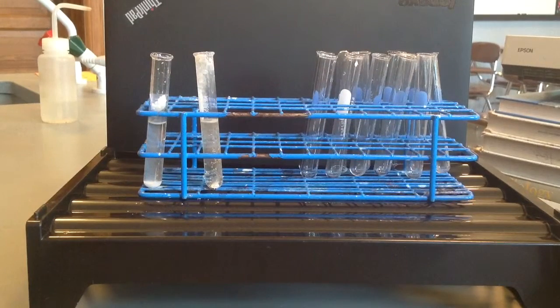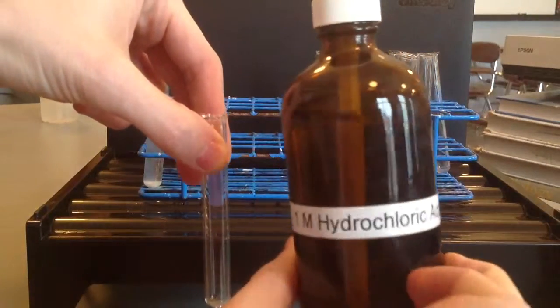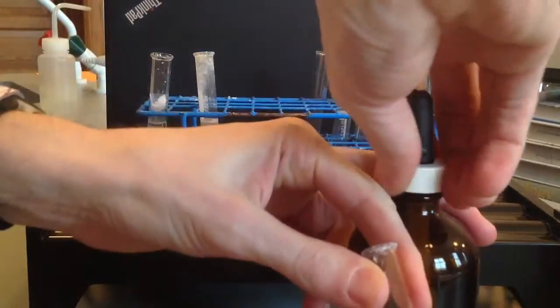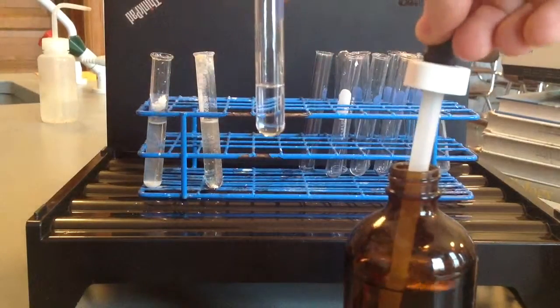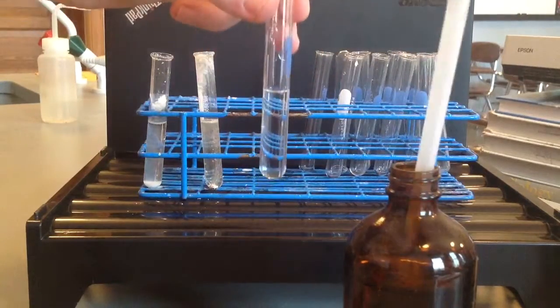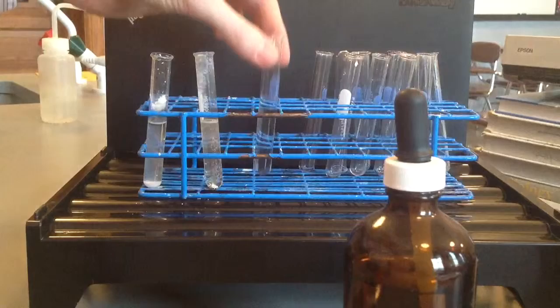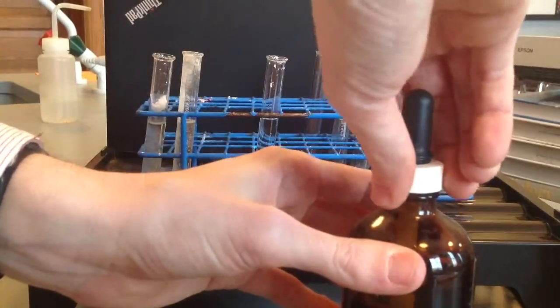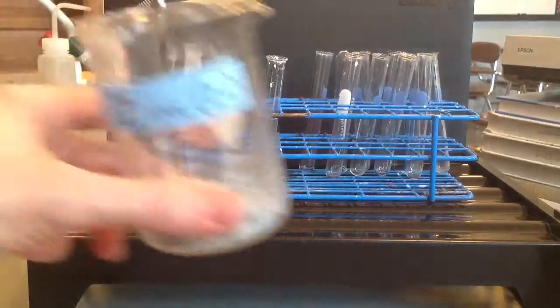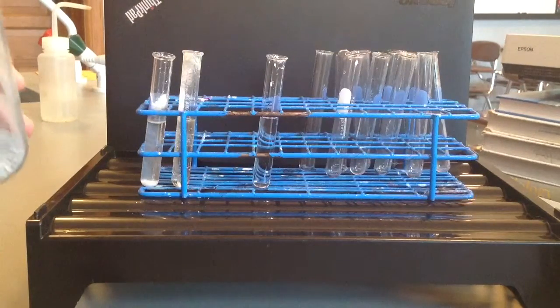All right, moving on to step three, the hydrochloric acid and zinc, which is the first part of step three. So here is our test tube, and here is our hydrochloric acid. All right. I'm going to move the acetic acid and calcium carbonate over a little bit now that we're kind of done with it. And now for our zinc. I'm probably going to take a couple chunks of it in.